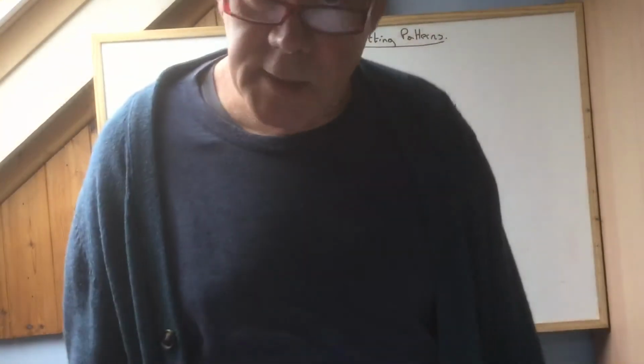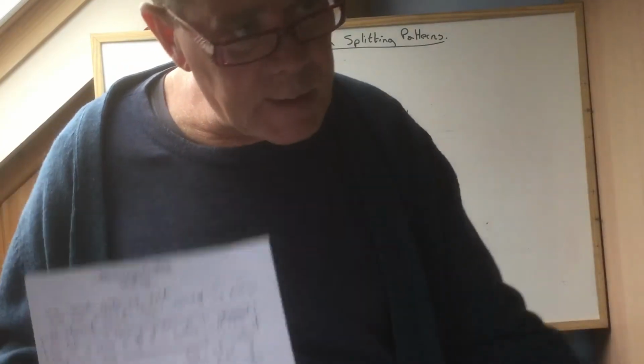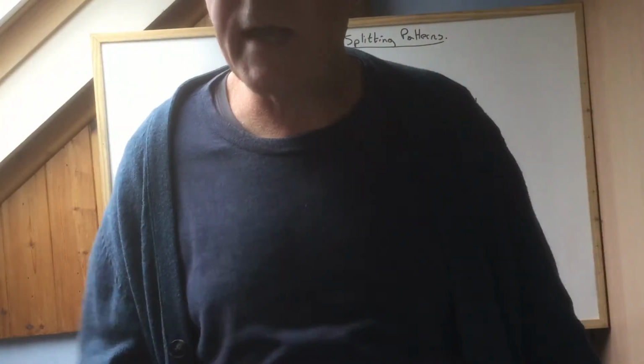Okay, right, number 2 in my sequence on splitting and spin-spin coupling. What I want to do now is show some common splitting patterns. They're a bit out of context, but they will help you quite a lot to focus on some common patterns that you may or may not get in a sequence in a molecule. But again, it's to be taken as an overall thing. You will see these will help you to focus on certain things later.